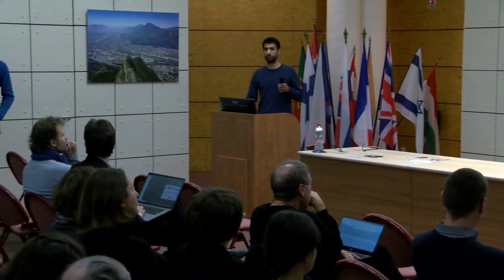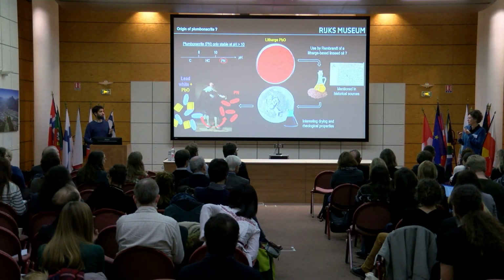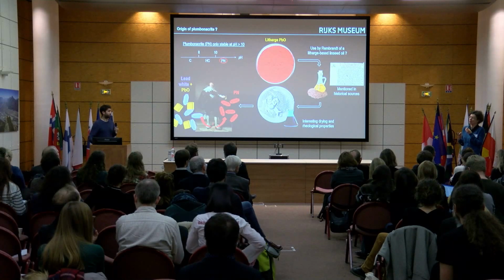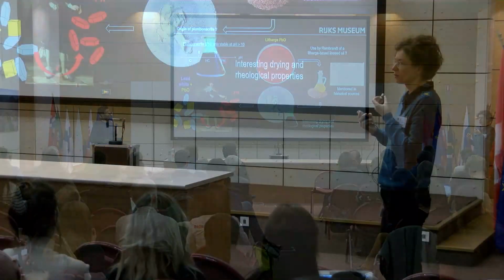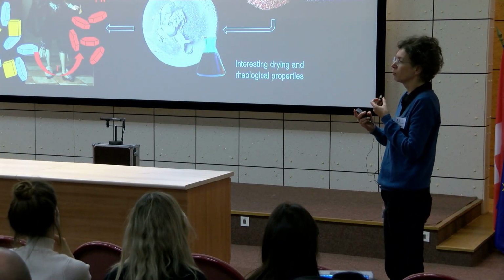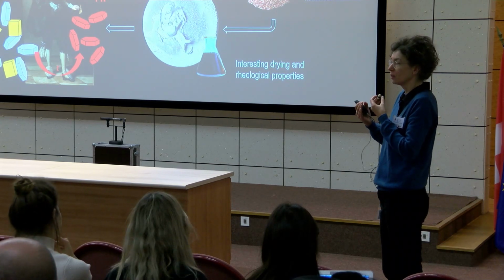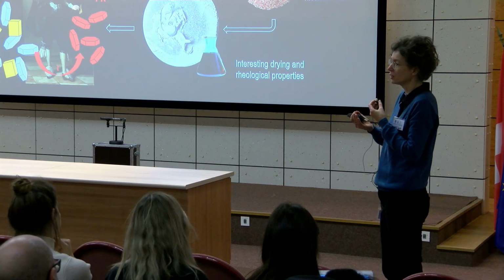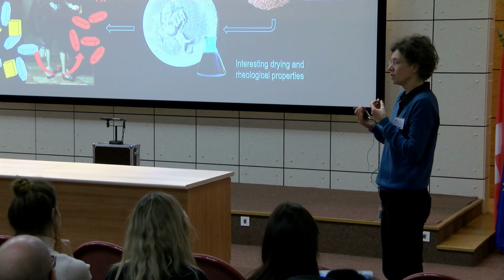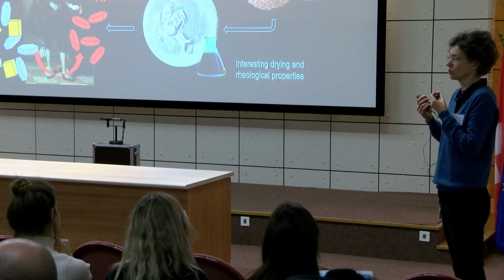Some other questions? Oh, it may be that in the samples where you detected plumbonacrite, it also comes from lead oxide. Yeah. But basically, our hypothesis is that when we found plumbonacrite, it means that lead oxide was probably used, and probably at such an extent, or with particles so big that it remained available for reaction with CO2 and water to form plumbonacrite, even if there are probably many cases where litharge was used, but completely reacted with oil to form lead soaps.